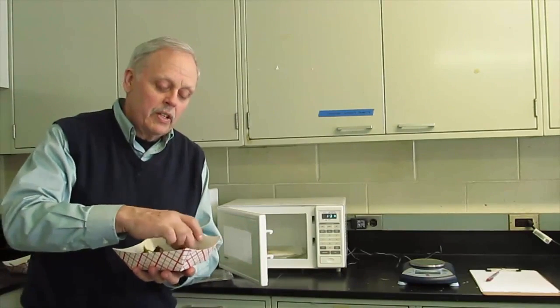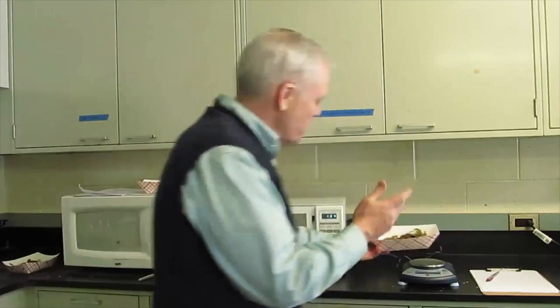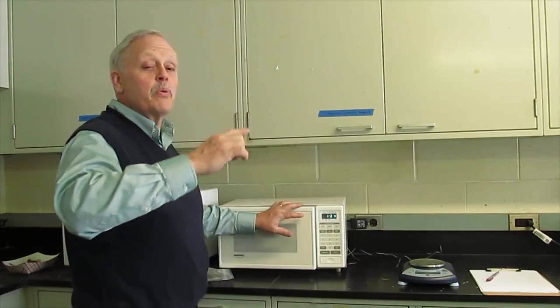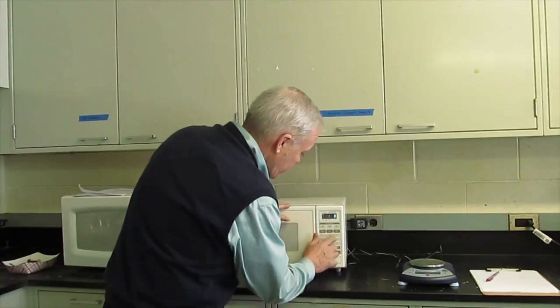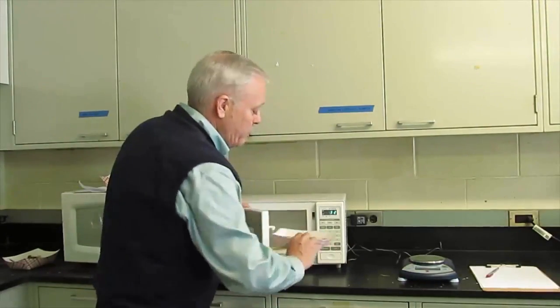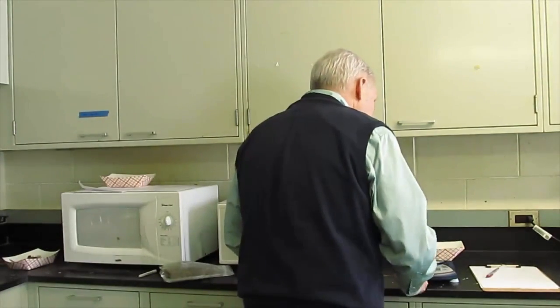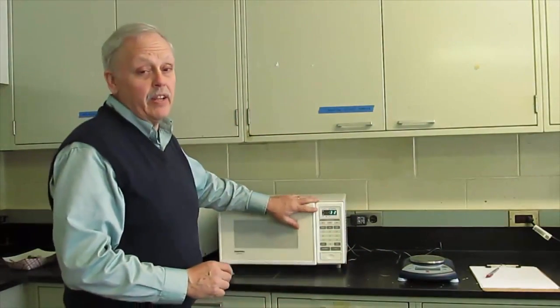Record the weight. If it's not anywhere near dry yet, put it back in for about 35 to 40 seconds. Each subsequent time it goes back in for a shorter time period. When your sample is about dry, take it out — it will be pretty obviously getting quite dry. Take a weight on the sample, then put it back in for very short intervals, like 10-second intervals, to make sure it is finally dry at the end.